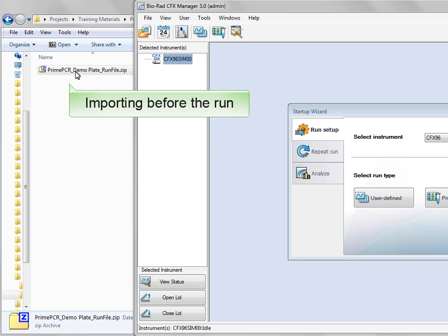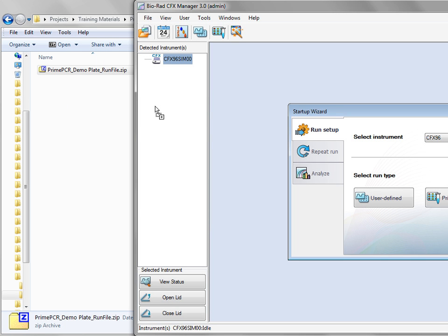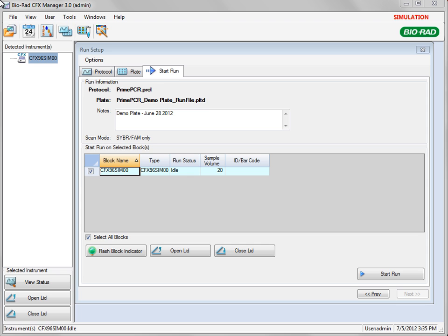Drag this file from the download location onto the main window of CFX Manager. The run setup window will open on the Start Run tab. Once an instrument has been selected, you can begin your run by clicking Start Run.